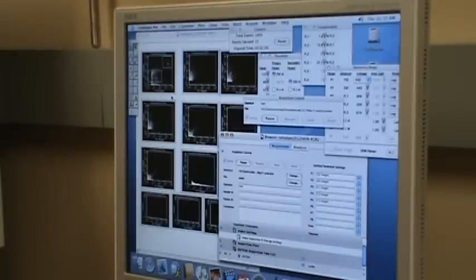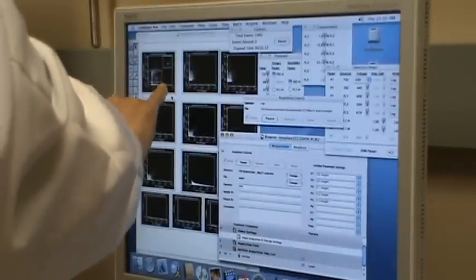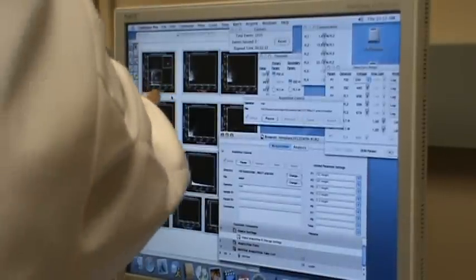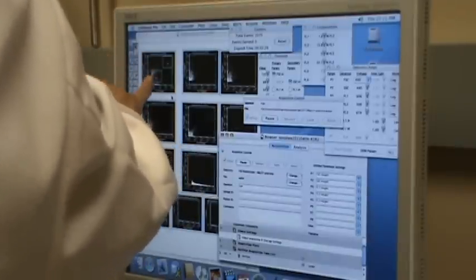I forgot the term. Okay, but in this case you can see there's a lot of dust in that water. That water looks clear, but there's so much dust that you will see here. Those are on log scale. You really need to pay attention to the scale. Those are log scale, 10 to the 1 to 10 to the 4. So that means it's a very small particle on this side.